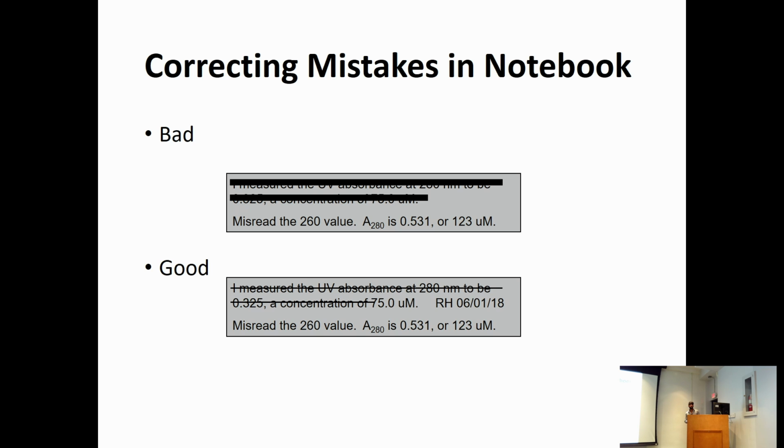You want to be able to read it so you don't make that same mistake again. That's why. Okay, that's also good. So what do you think, is it bad because it's making a mess? What about that? The lab notebook is a mess. Date? No, there's no connection with the date. No.